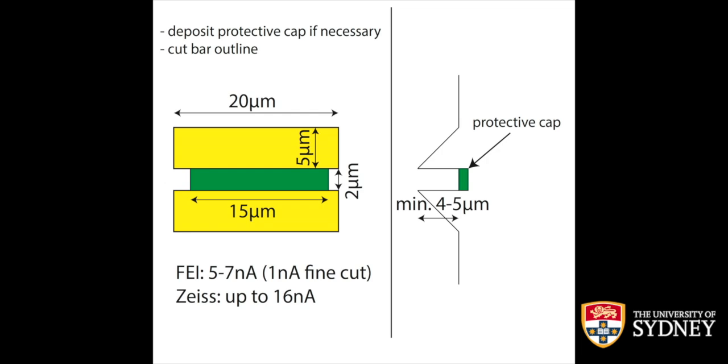you have a variety of choices, of course, of ex situ methods. In our Auriga system, we have a very helpful way of doing this available, which is using carbon deposition, using naphthalene. The carbon that you deposit is actually fully amorphous, and it's got a very low sputter yield, which is very handy. The problem, of course, is if you have a carbon cap on your sample, the likelihood that it's going to fail in the atom probe is very high.